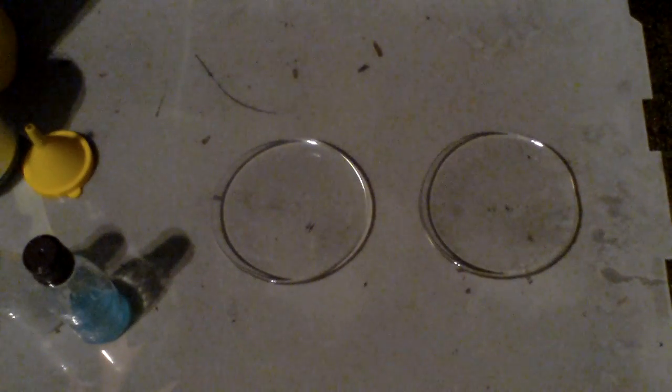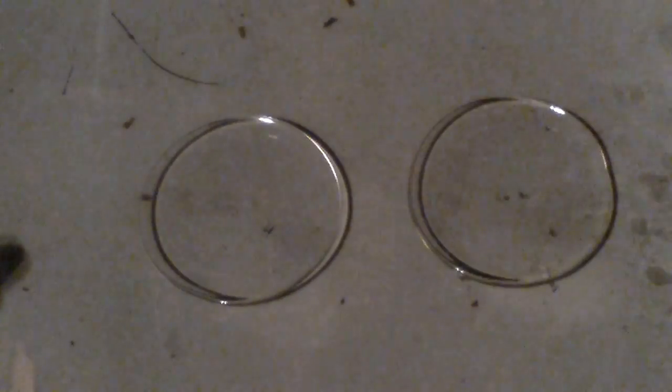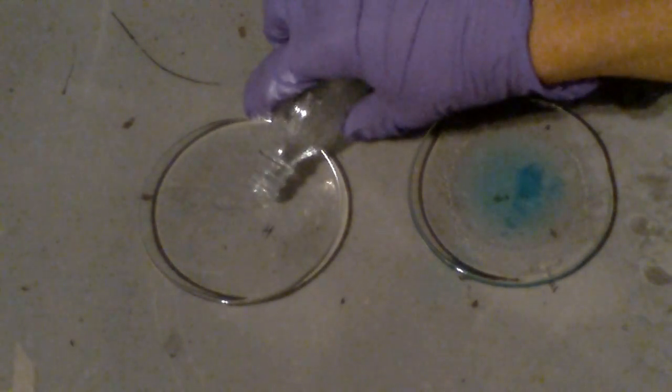Now I'm going to change the view a little bit and zoom in. And now all I have to do is pour out the solutions onto a watch glass and light them.